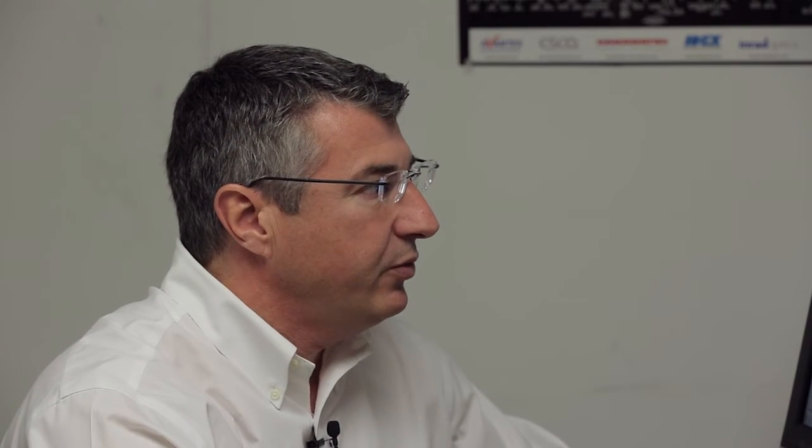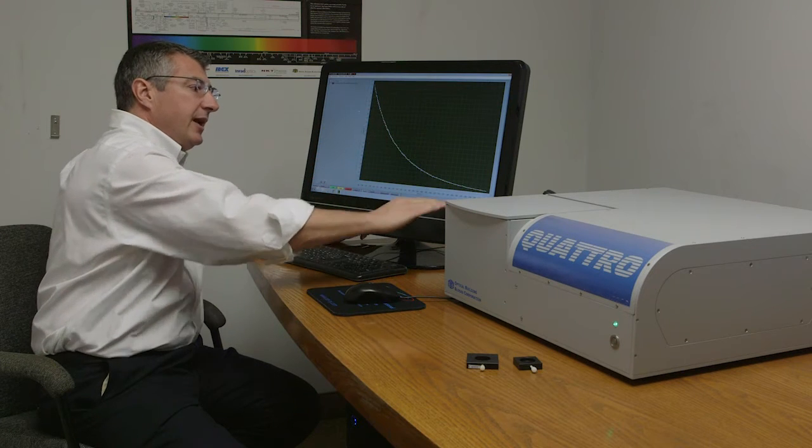However, I wanted to also demonstrate just how fast this instrument really is. So we've collected this really good looking decay in only one second. Already that's faster than most phosphorimeters will ever do.